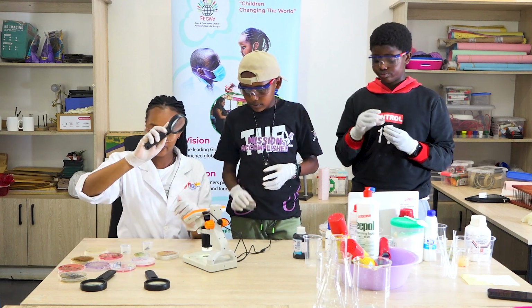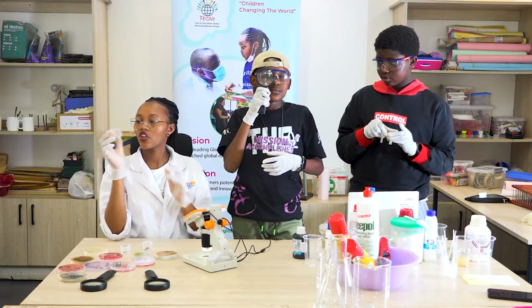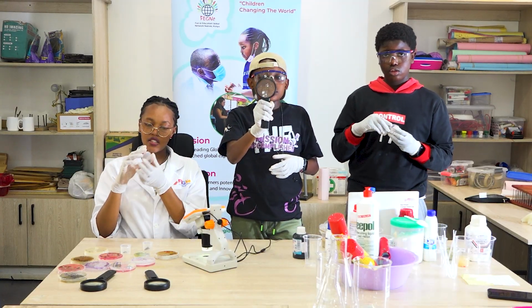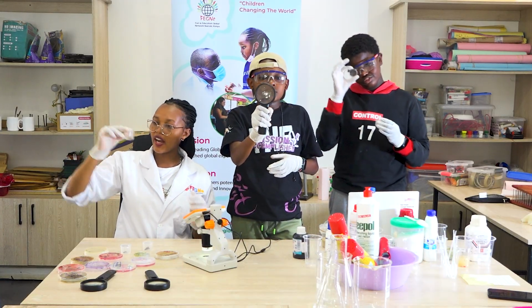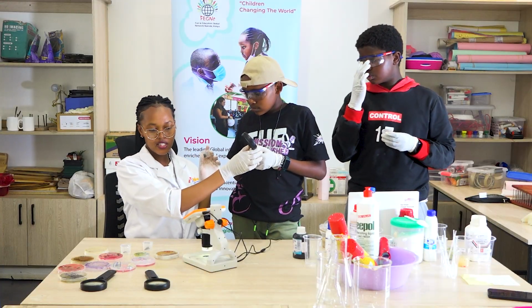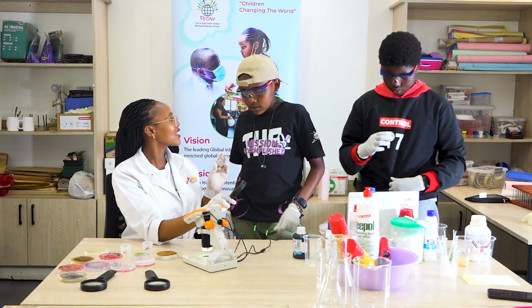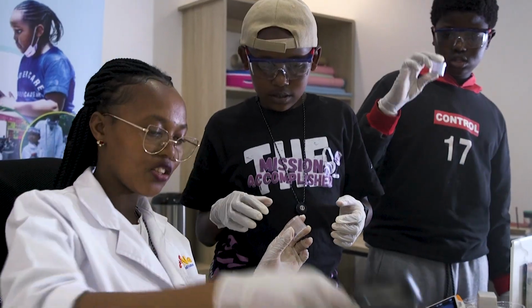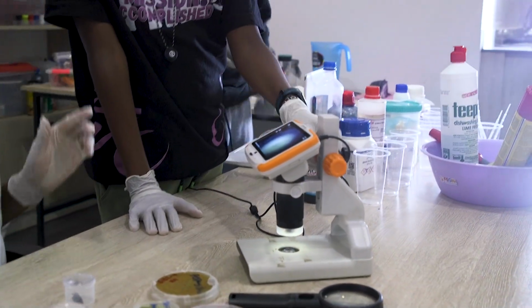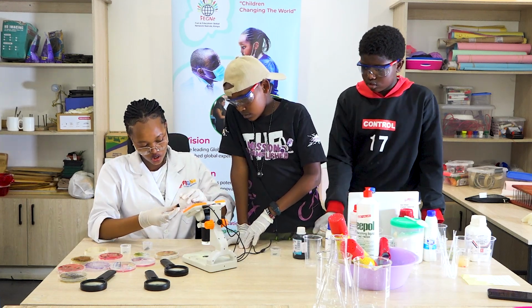Okay, we also have lenses, so you can tell the magnification for these containers at the lid. They have a magnification, so it's not the same as how you can visualize it using your bare eyes. The magnification increases from this to the lens, and then to the microscope to see how it looks. So we'll start with the millipede under the microscope and place it on the stage.